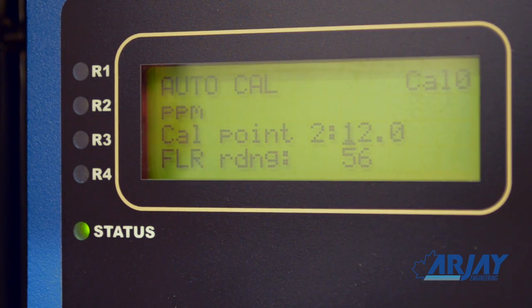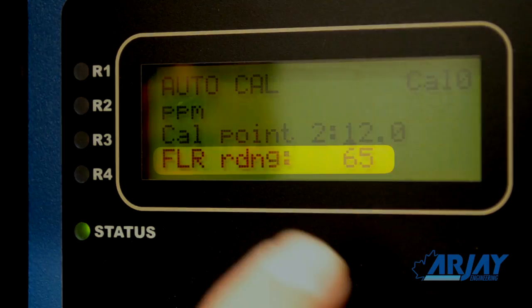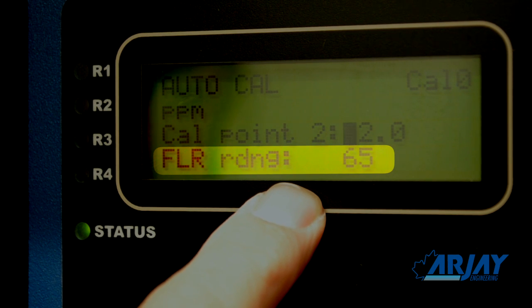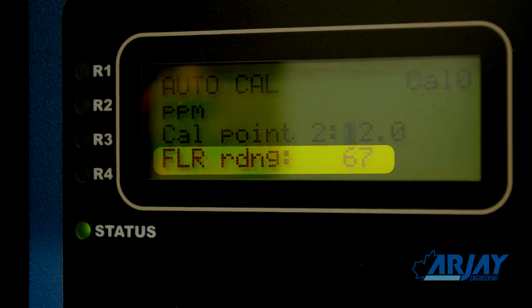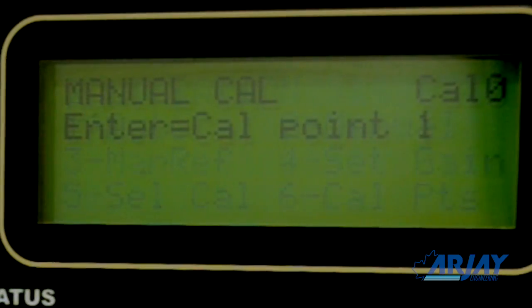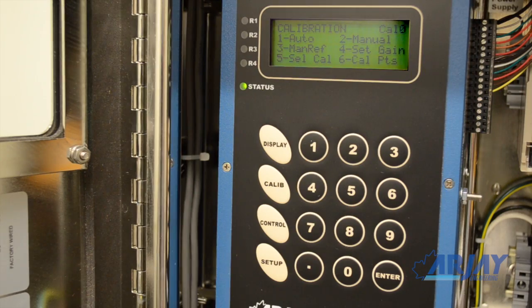Do this procedure at least one more time with a different stream concentration. A change in the stream concentrations is observed by the changing fluorescence reading on the display. Nothing more needs to be done until the lab determines the true PPM values from your samples. Once known, enter the manual mode and correct your initial PPM values. Calibration is complete.